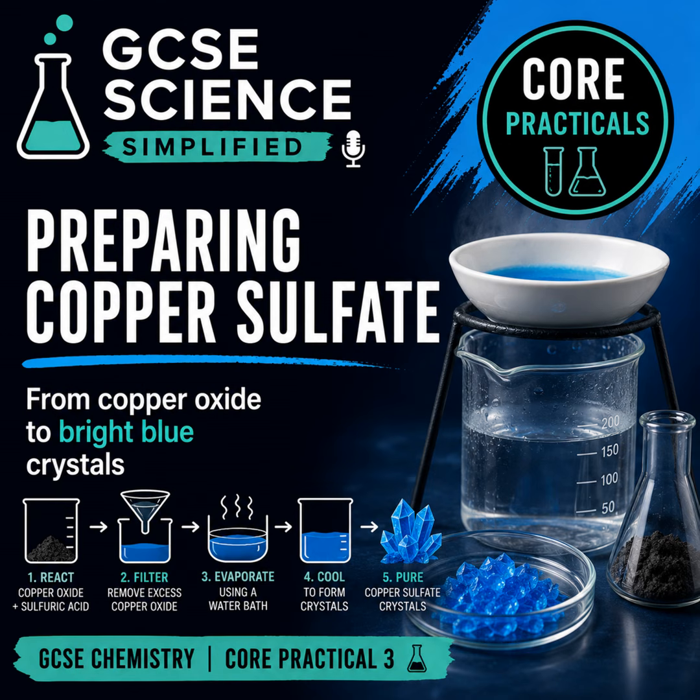Step 2. Add the copper oxide. Bit by bit, stirring as we go, and at first it reacts and disappears. But eventually it stops disappearing and a black powder remains. That's your signal. The copper oxide is now in excess. But why do we do this? Because we need to make sure all the acid has reacted. If you didn't add excess, some acid would remain, and that would mean our salt crystals at the end would be impure.